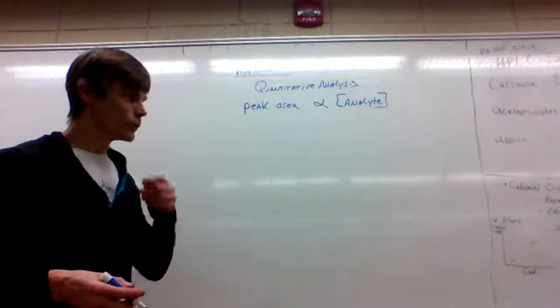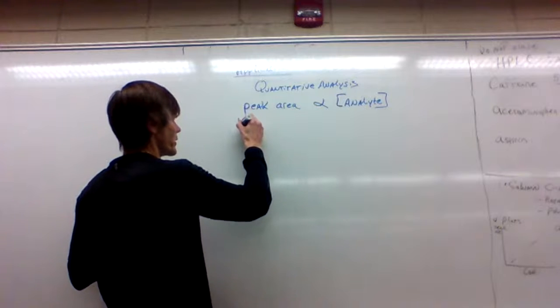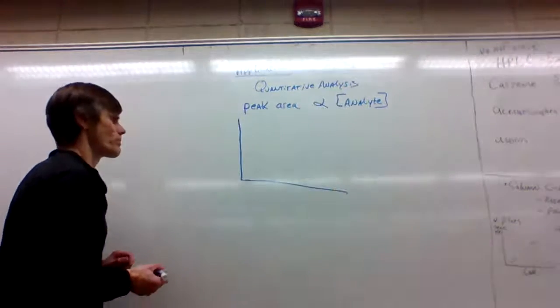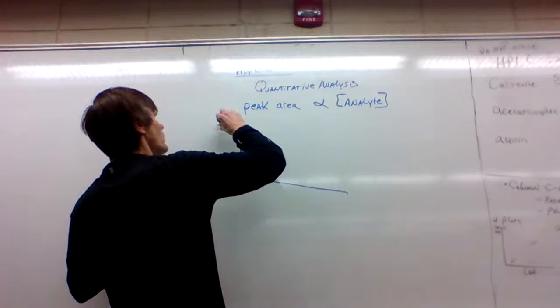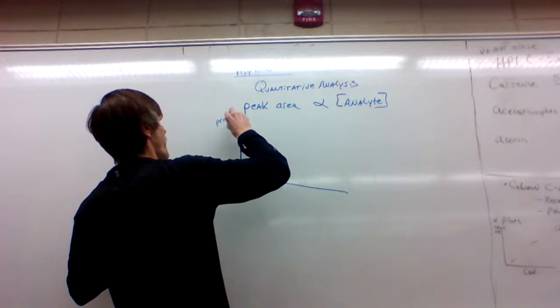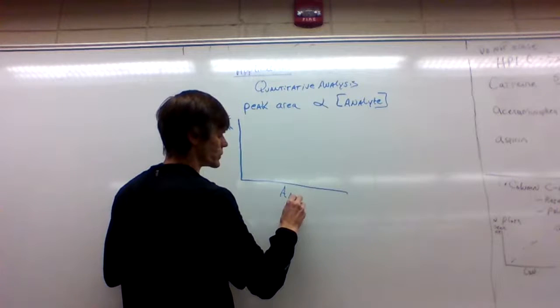So what we would do is we would create a calibration plot. And you would have your peak area versus analyte concentration.